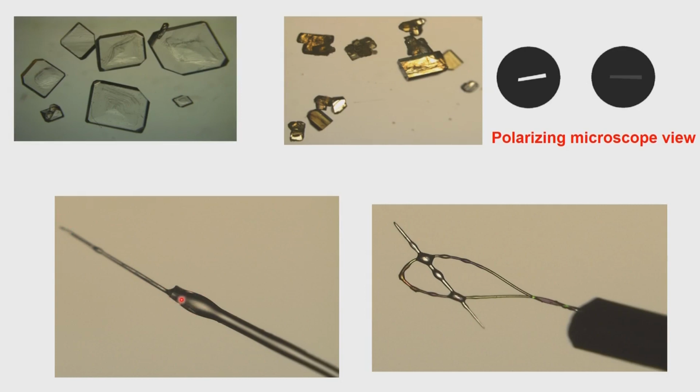Of late, for data collection, particularly if the crystal is small and also if the crystal is a protein crystal or whatever, we have what are called the loops. So, this is a loop mounting with the help of an oil. In this particular case we use different kinds of materials. When you are doing, let us say, a data collection at 100K, you can use an oil which is now holding the crystal at this point, and then at 100K it will freeze.